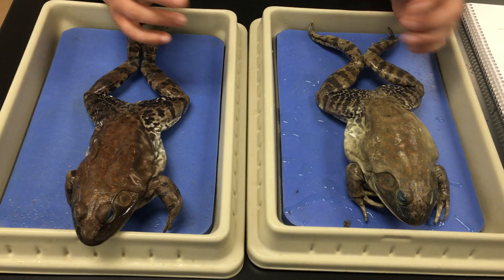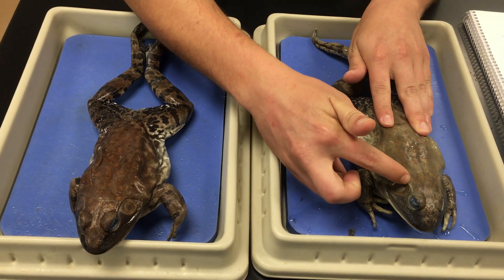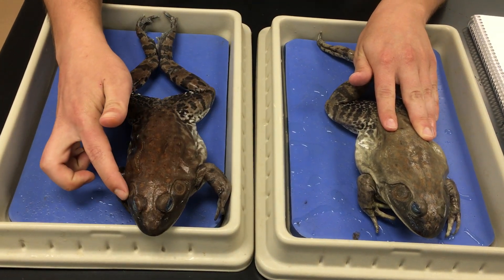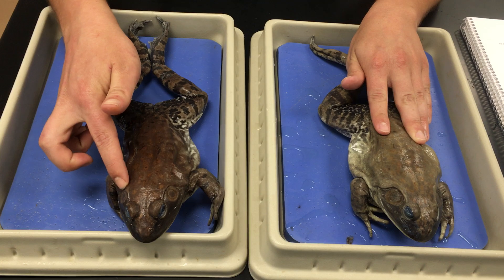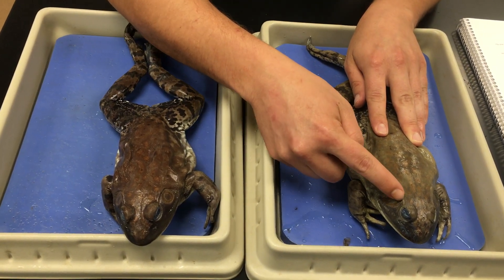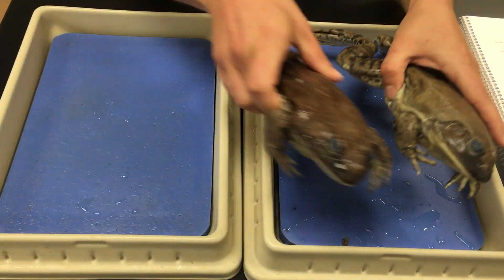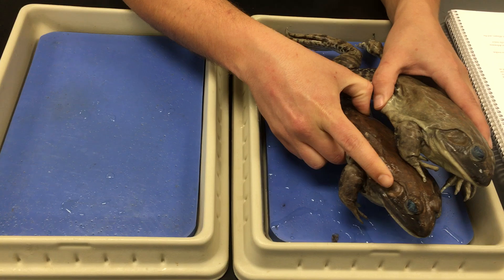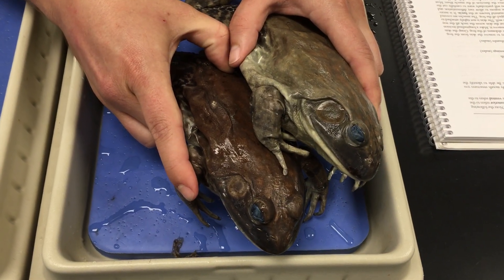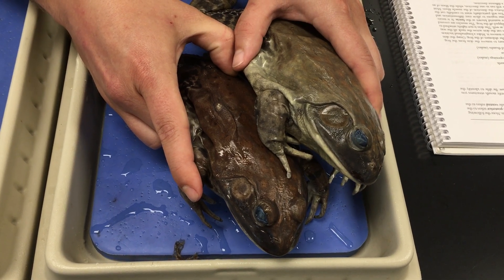One of the most obvious differences, in my opinion, is looking at what you might call the ear. This structure is called the tympanic membrane. Be sure to be following along on page 98 in your lab manuals. The tympanic membrane on the male bullfrog is significantly larger than the tympanic membrane on the female bullfrog, so that's definitely something you want to be aware of when distinguishing between whether you have a male or female bullfrog.